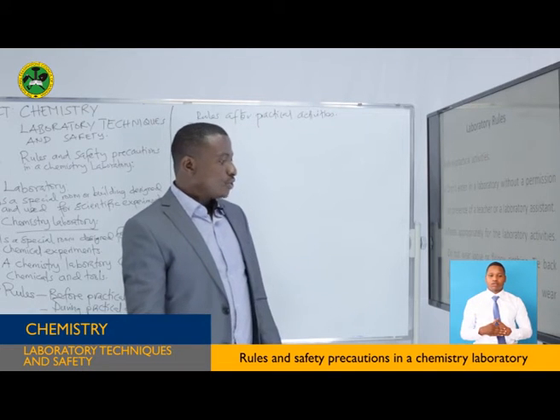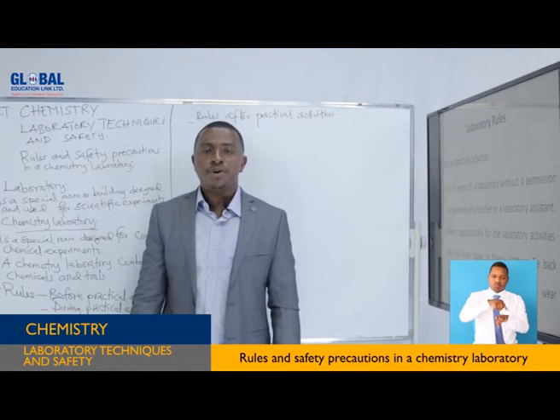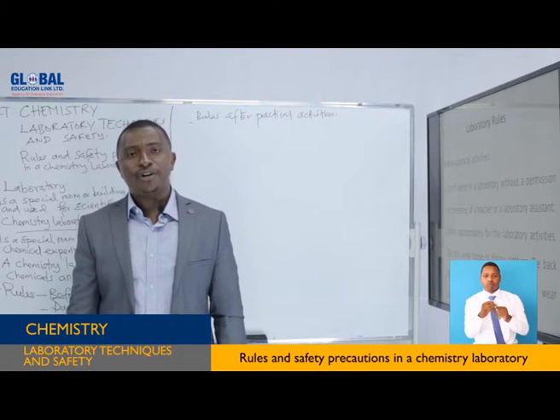But also you are told not to wear shorts. At least you should have a cloth that is beneath your knees, and you should roll up your long sleeves. If you have worn a shirt with long sleeves, roll them up, and do not walk barefoot or in sandals. Please never walk barefoot in the laboratory, or put on sandals, because when you put on sandals, your open toes are at risk of coming in contact with harmful chemicals.